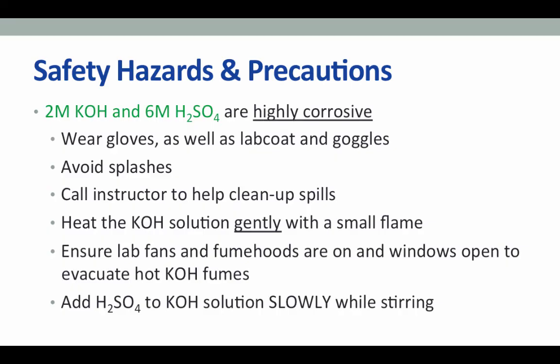For the strong acid, sulfuric acid, and the strong base, potassium hydroxide, these are both highly corrosive chemicals and can easily cause burns on exposed skin. Make sure you're wearing gloves in addition to your usual lab coat and goggles. Avoid splashes and always look around you before moving with a container full of potassium hydroxide or sulfuric acid. You should never fill a container near to its capacity with these solutions, but rather use a larger container if you need to move from the fume hood to your bench, for example.